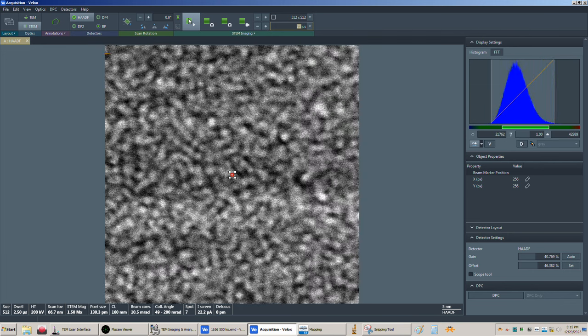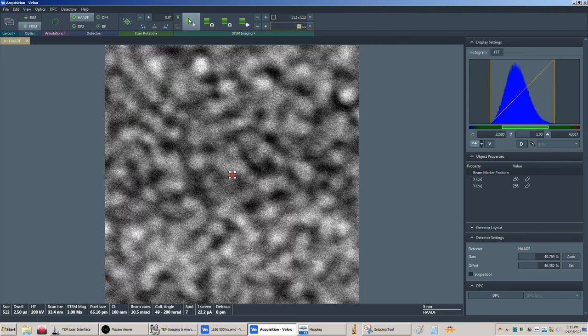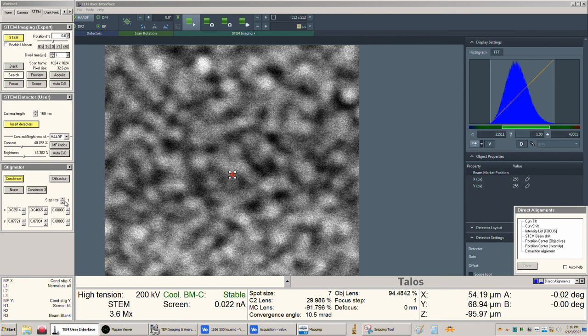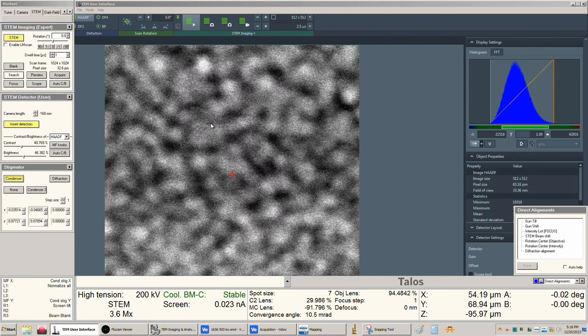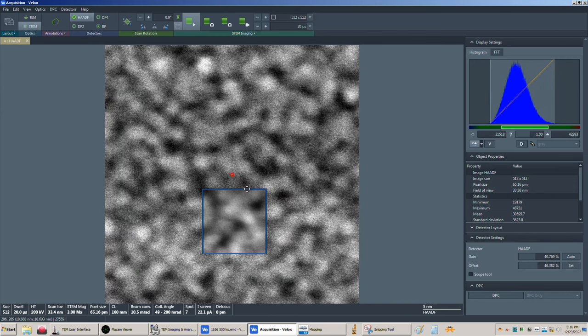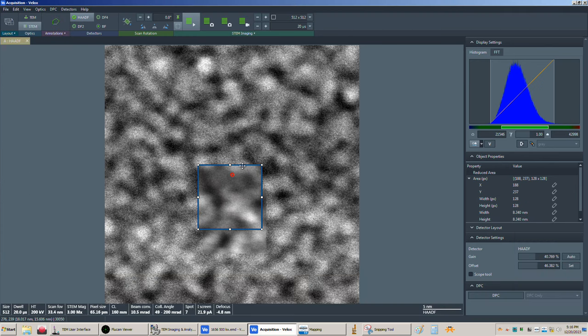Now if you wanted to do some additional tweaking here of the astigmatism, we would want to do this looking at the actual image. So we're going to come back here and click Stigmator. We want to use the finest step here. For any additional tweaks, I'm using my focus knob, and I'm at step one. You can see there's my defocus right here. Again, very low values, not very far from zero.